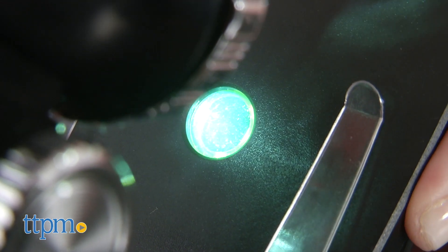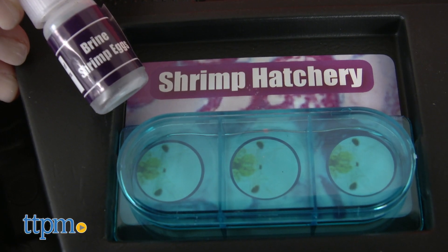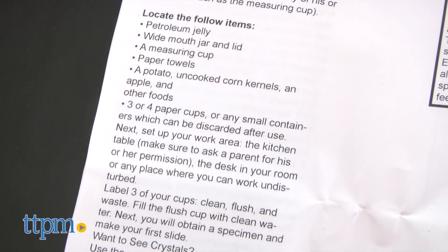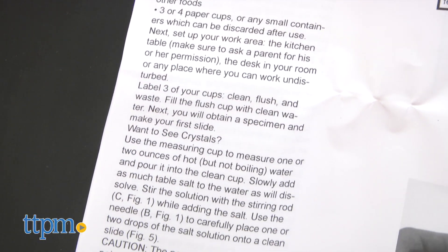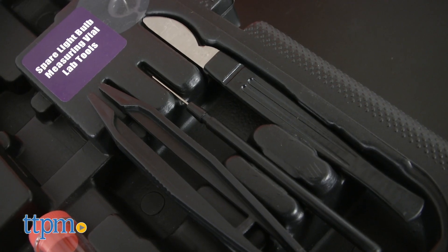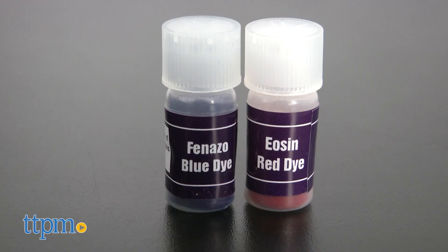There are also tools for hatching and observing brine shrimp, and the instruction booklet provides a few suggested experiments with household items to get kids started using their microscope and tools such as the slides, the needle, the scalpel, the tweezers, and the two dyes.